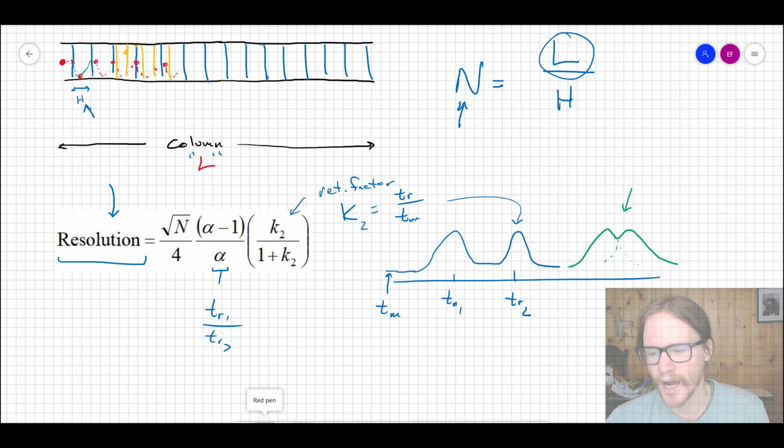Here are these compounds. I'm trying to measure PFAS in, I don't know, cornflakes. And I'm trying to separate these things, and these two compounds are just not resolving well. How should I think about my plate height and my resolution?